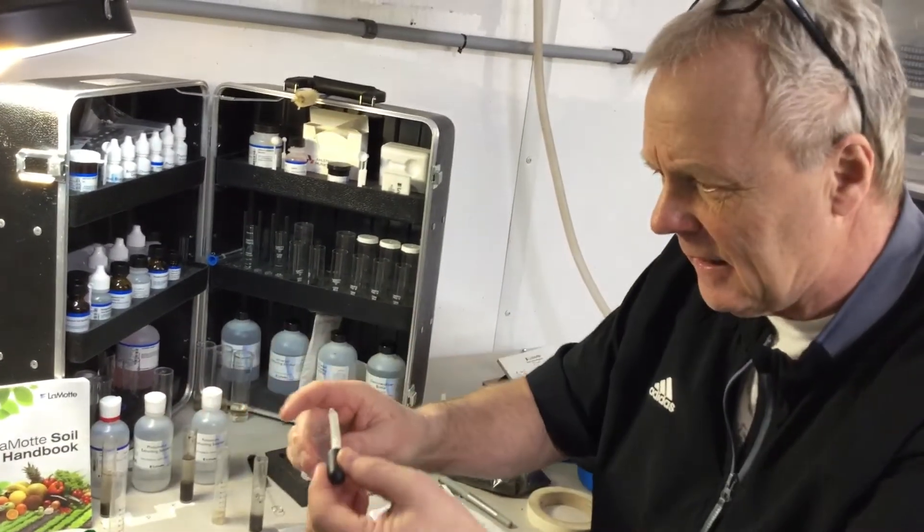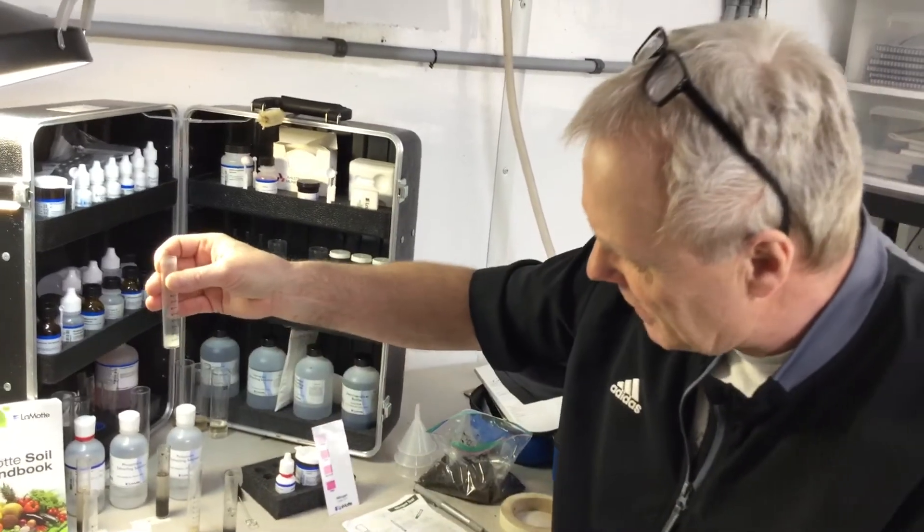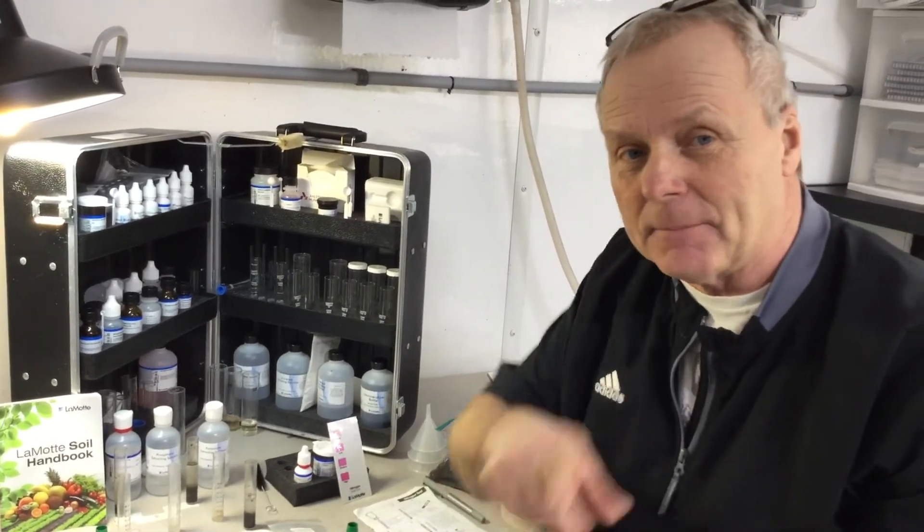I'll keep repeating that until I get to three — that's a little bit better than one right there. So we're going to get those all set to go, and when we come back we'll show you the next step. We'll be right back.